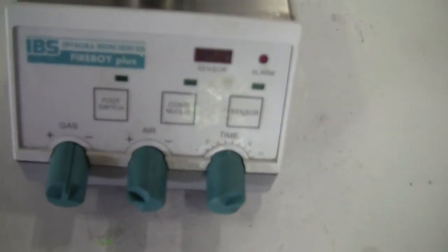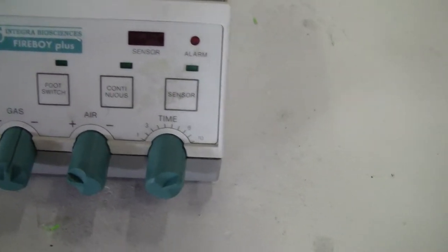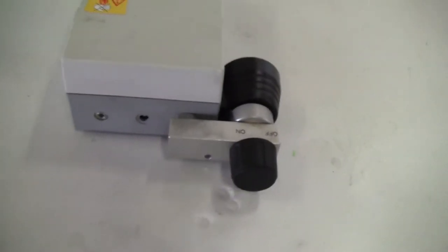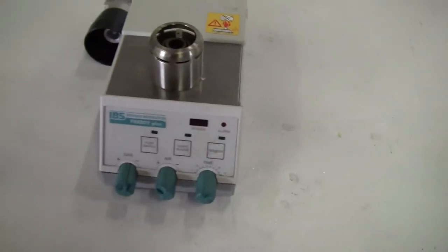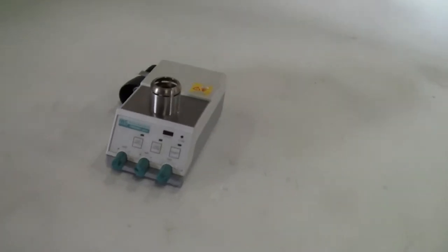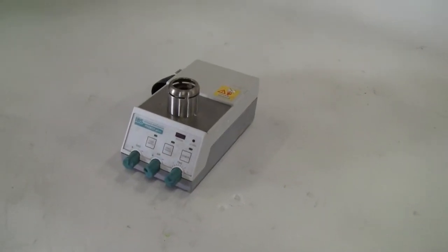You can hook it to a foot switch, continuous mode, and there is a timer on it. Okay, that's pretty much it. If you have any questions, please give us a call, 679-518-9100. Thank you from High Tech Trader.